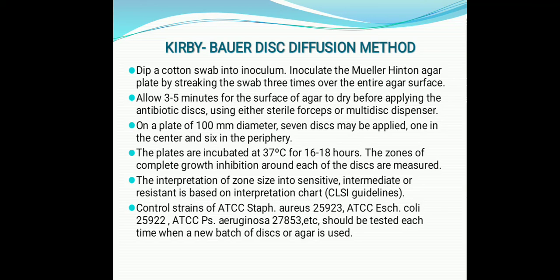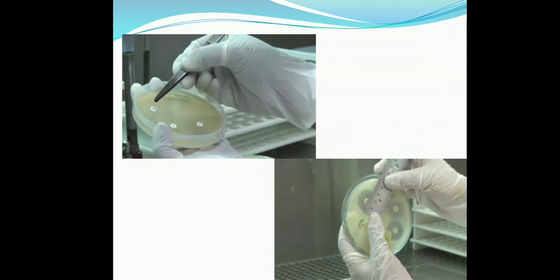These should be tested each time a new batch of discs or agar is used, to make sure that we don't get any false results. So this is how we perform the Kirby-Bauer disc diffusion method.